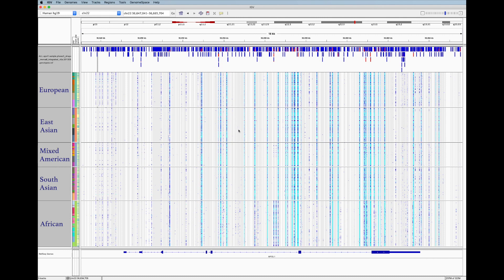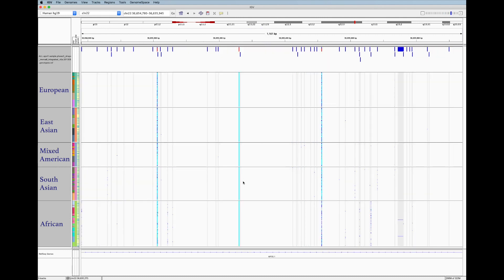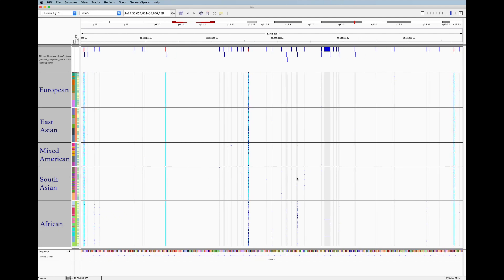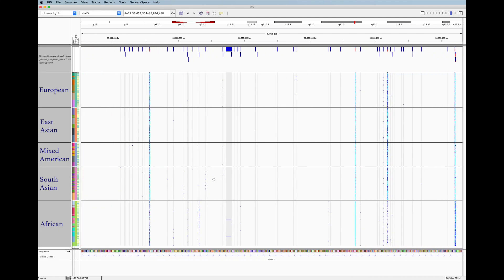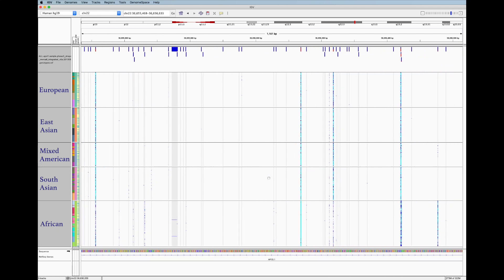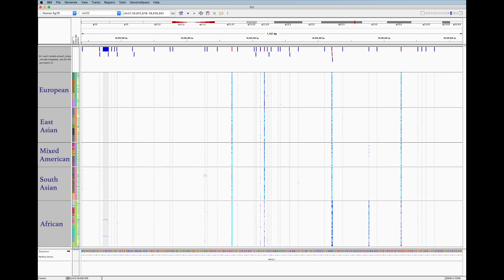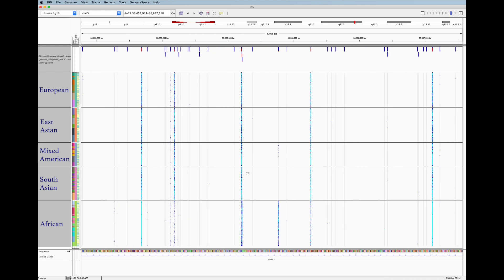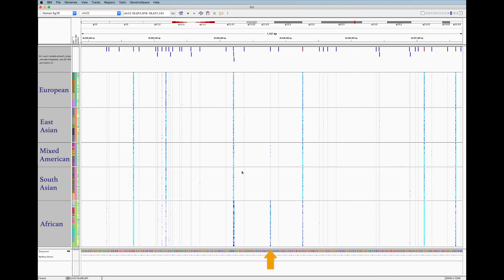If we zoom in and start scrolling through the data, we notice that most variants occur at a similar frequency across the superpopulations. But look at this variant. It looks like this variant occurs almost exclusively in the African population.